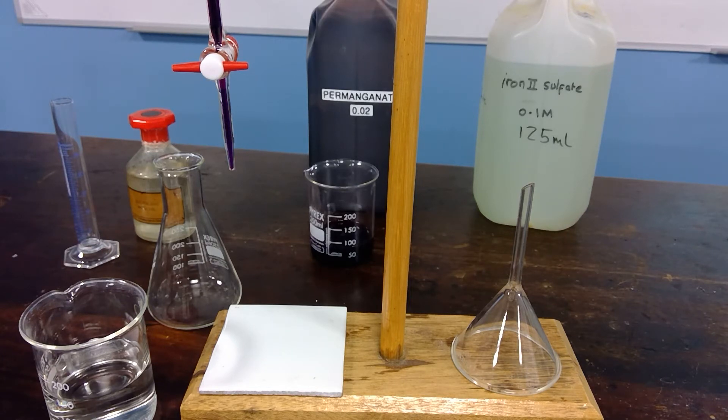The first part of the experiment involves standardizing the potassium manganate 7 solution. Potassium manganate 7 slowly decomposes with time, so the solution has to be standardized — find out what concentration it has — with a solution that keeps its concentration fixed for a longer period of time: a standard solution. In this case it's iron ammonium sulfate and it has a concentration of 0.100 moles per cubic decimetre.